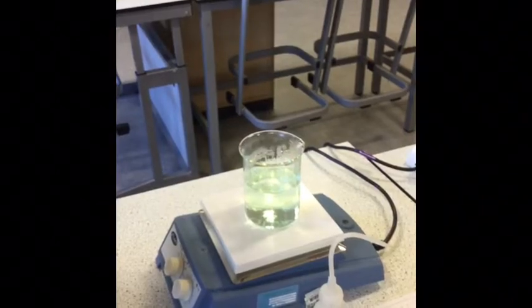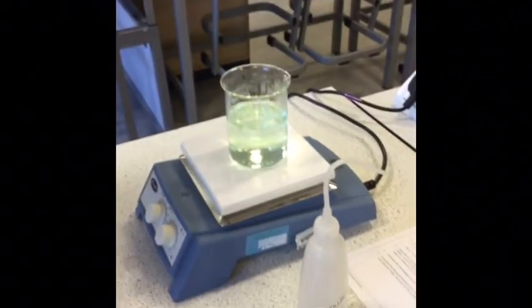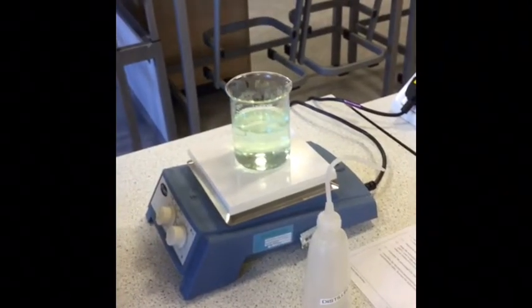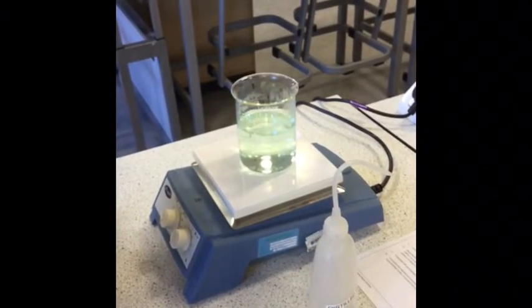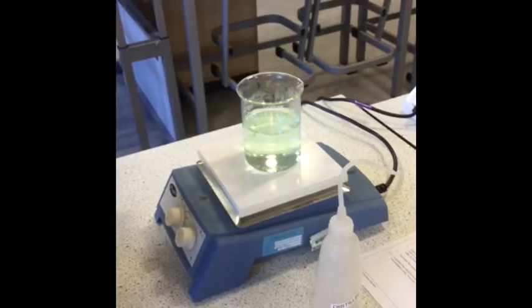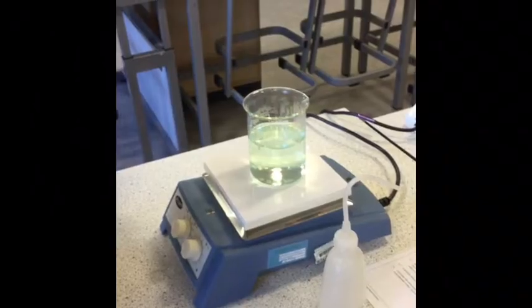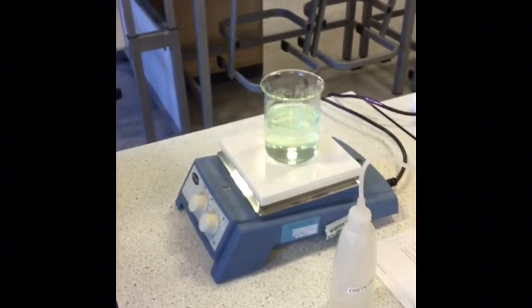So we're now going to add some ammonia. The instructions say add 2 mole per litre ammonia solution dropwise and with constant stirring until a permanent red precipitate is obtained. And it says you should add about 30 cubic centimetres of ammonia solution.